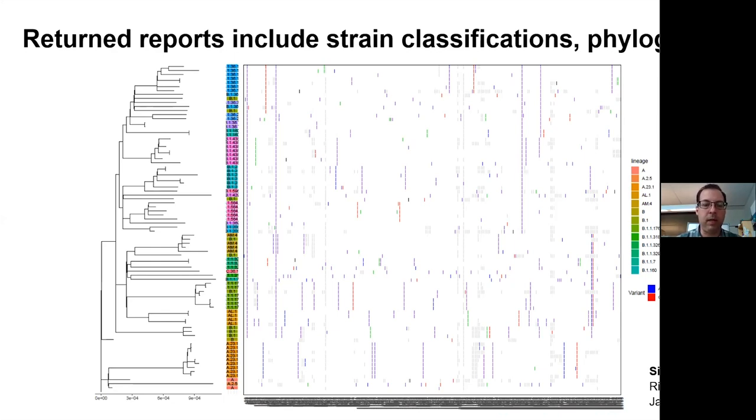So this kind of molecular contact tracing information is very useful to resolve those kinds of outbreak questions. And I believe it can only be done by whole genome sequencing.